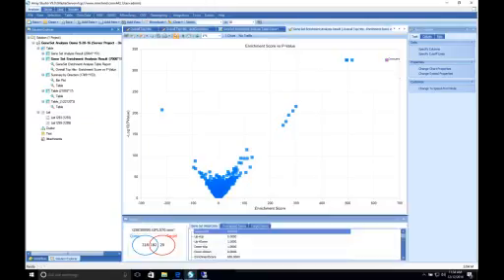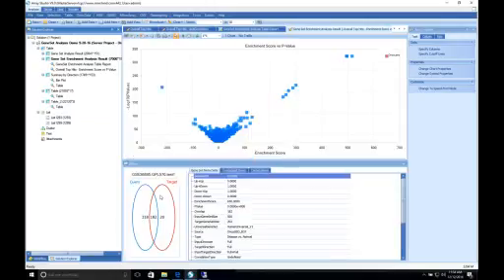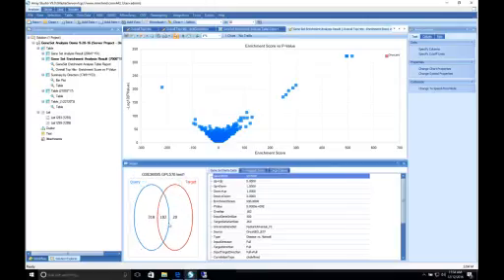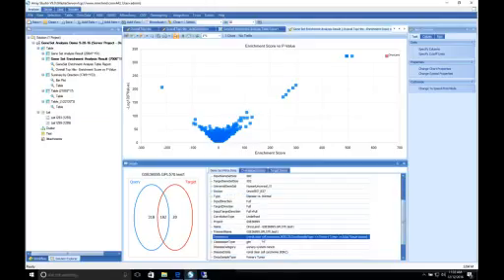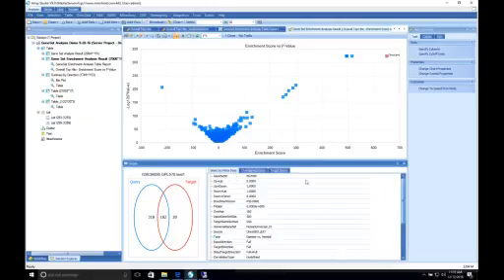And what it's going to do is show me how many genes were in my query list. 318, and 182 of them were overlapping. So 318 in the query, and 20 were not overlapped from the target, but there was an overlap of 182. We can see it came from the OncoGEO project, and we can see that it's renal clear cell carcinoma, primary tumor versus solid tissue normal. So what it's telling me is that I'm in a positive, correlated direction. I'm hitting an overlap with this gene set.